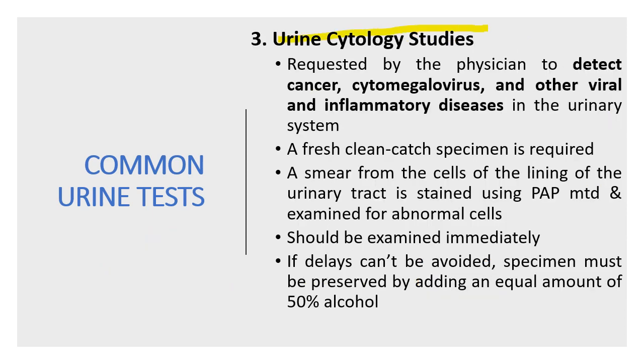Next, we have urine cytology studies. So it detects cancer, cytomegalovirus, and other viral and inflammatory diseases. So ito dapat in-examine immediately. Tapos ulit, dapat ang specimen is clean catch specimen.